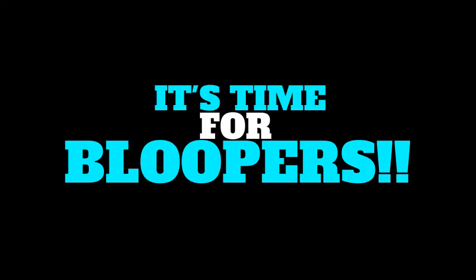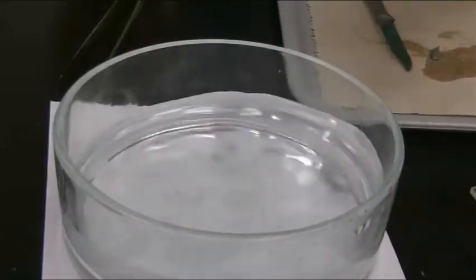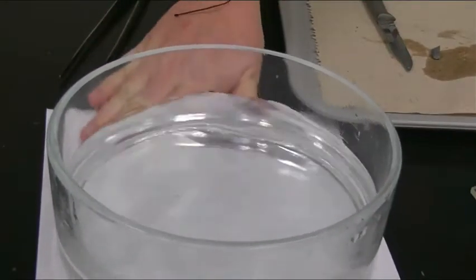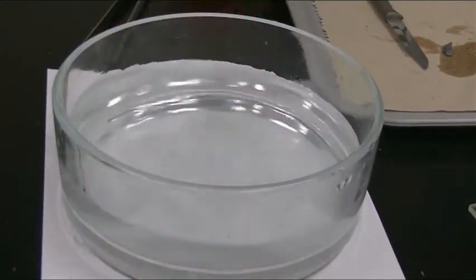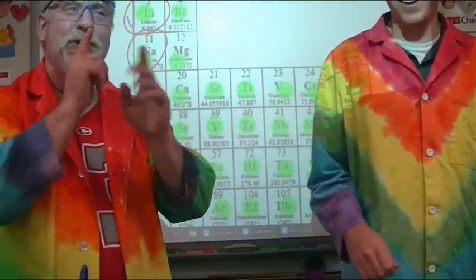Oh, beautiful! I think you might need some water to wash that down. Okay, let's try this again. All right, here we go. All right. Twelve times the charm. So again, this is why we don't use a bigger piece of the lithium, because the lithium takes a good old time reacting. It's a good little guy, but it takes time. Oh, I don't want to do this again.